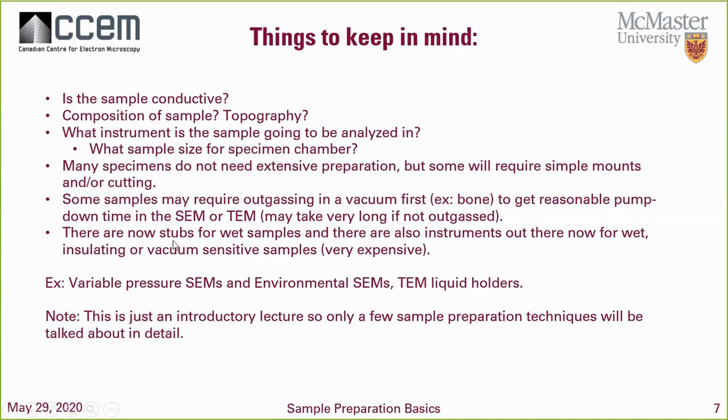So I want to highlight that there are some limitations as well to having wet samples, and especially in conventional SEM and TEM, where you need these extra features like the liquid holders for the TEMs to be able to look at them. And again, this is just an introductory lecture, so only a few sample preparation techniques will be talked about in detail.